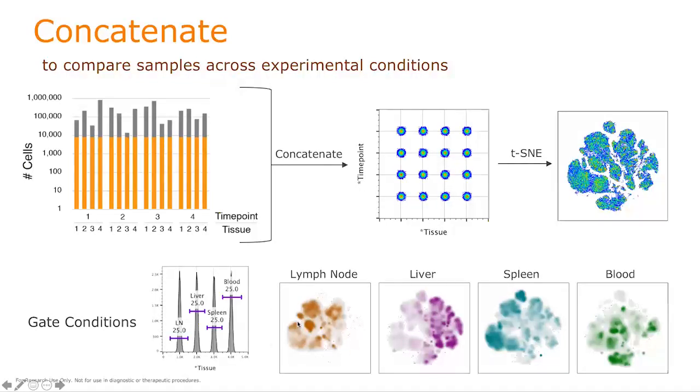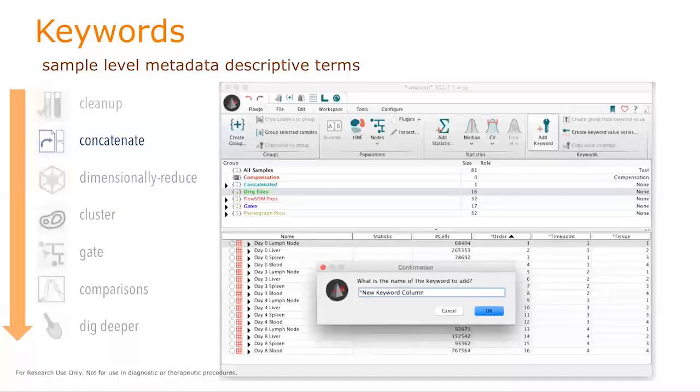So once you know what the map looks like, based on your investigation with overlays and color maps, you can make those determinations of what these regions represent and easily visually see that they are contributing different populations to the system here.